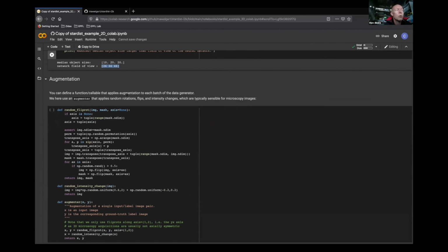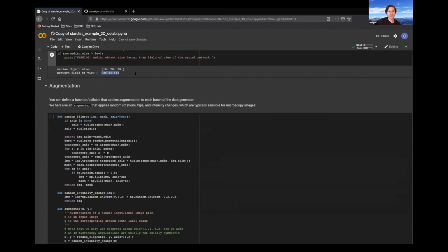Do you recommend UNet over ResNet or ResNet over UNet? So in most cases, it does a similar job. The only case where I would recommend the UNet is if your field of view is a little bit larger, if you see that warning essentially. Thank you. So yeah, but it should pop up. So you should realize that this is the case.